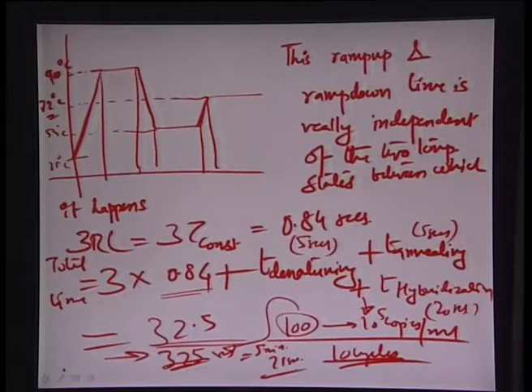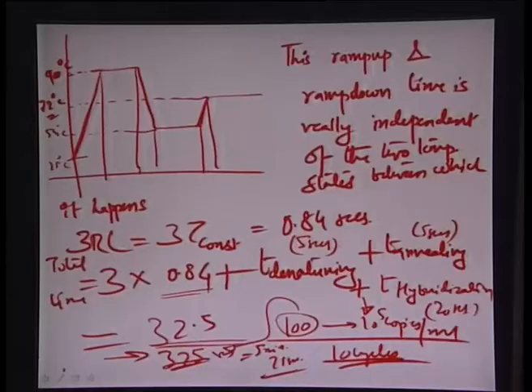In a macro scale reactor, a thermal cycler where there is a huge aluminum block, this would go as high as close to 2 to 3 hours, okay. So there is definitely an advantage that micro scale PCR has to offer.